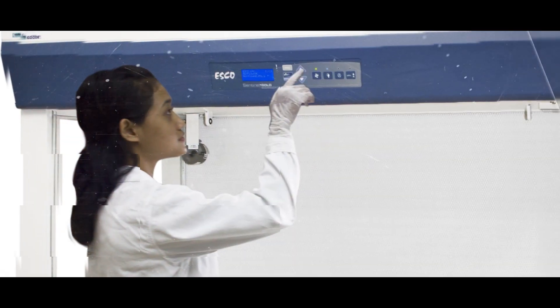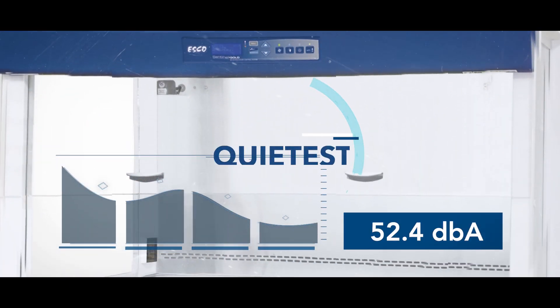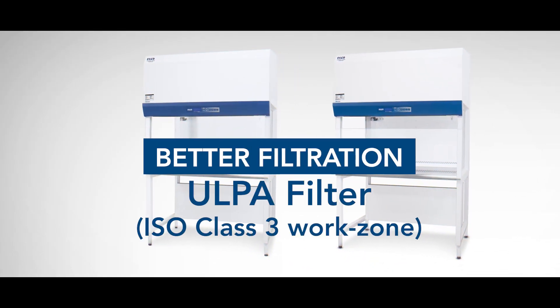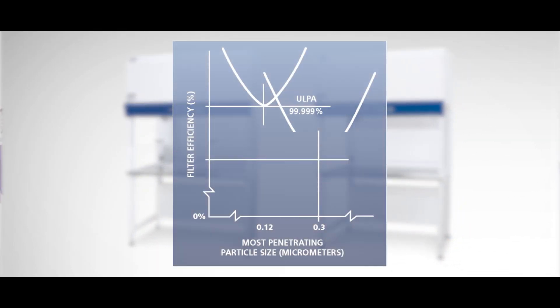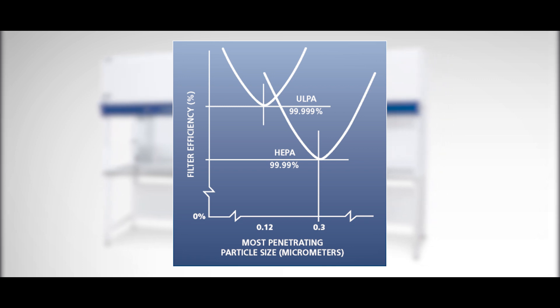The ESCO Airstream is designed to be ergonomic and the quietest laminar flow cabinet in the market. The cabinet provides an ISO class 3 work zone and is equipped with a ULPA H14 filter that is 10 times better than the usual HEPA filter found in most competitors.